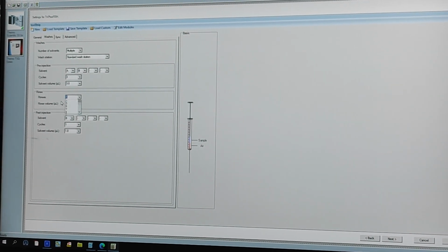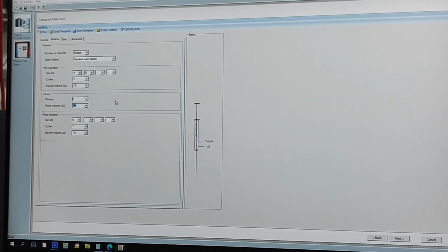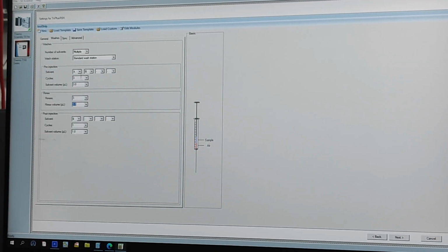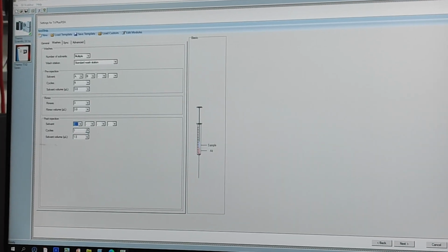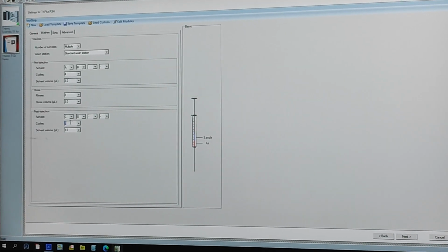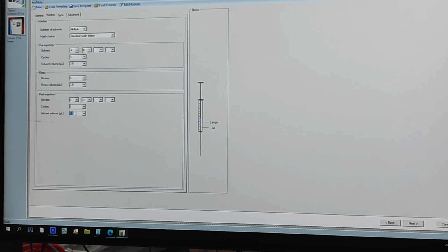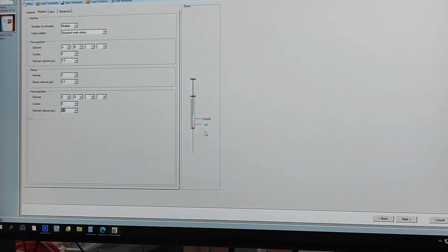Sample rinse also I will take 3 times. I will take 2 microliter here, or 3 microliter. Okay. Now here I will take C and D. Post-wash requires slightly higher time. So okay, why C and D?